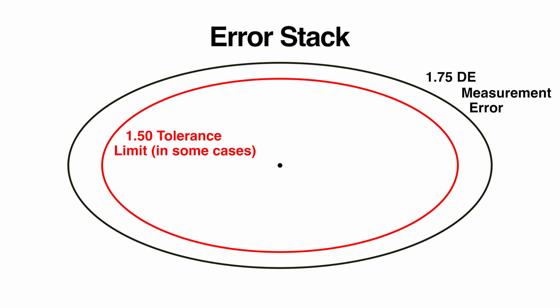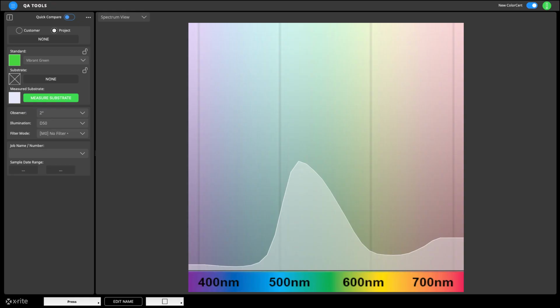Some people have tried to minimize this aging effect by creating new standards during each run, but this also increases the variation as we are constantly chasing the last production. Sometimes the impact is worse than using an aged standard.